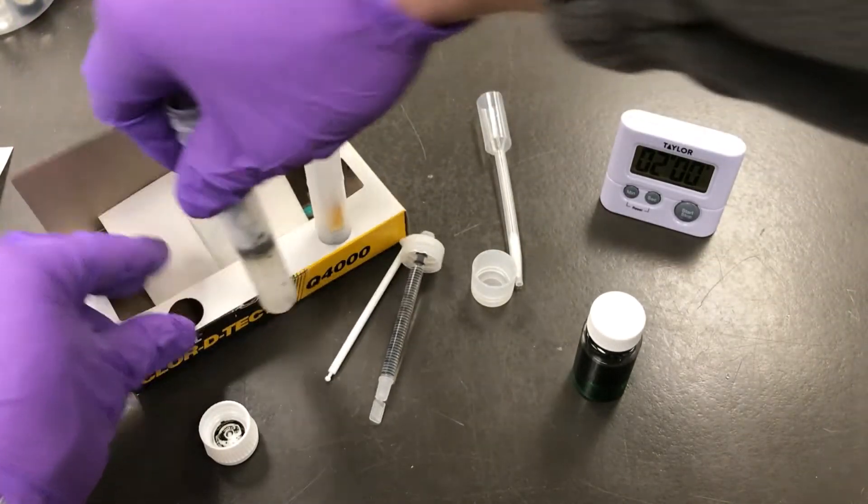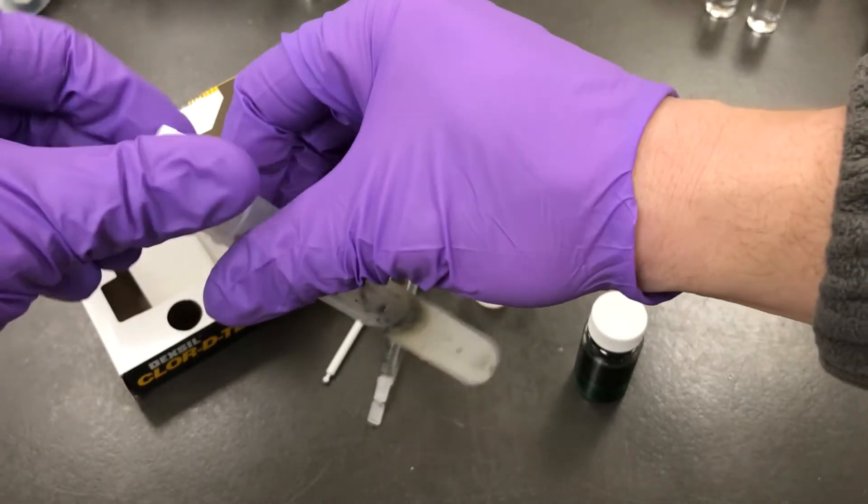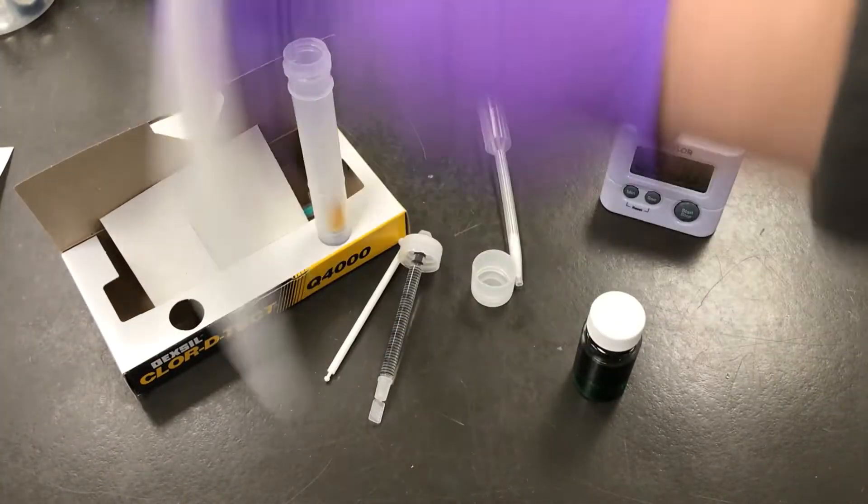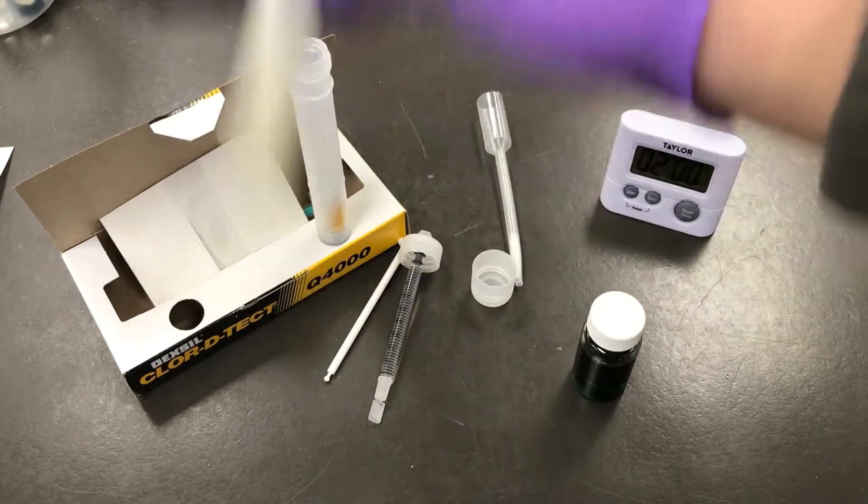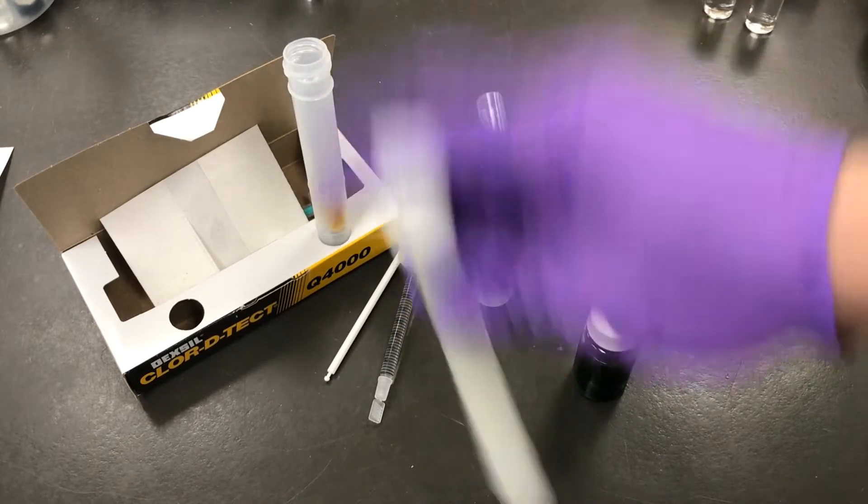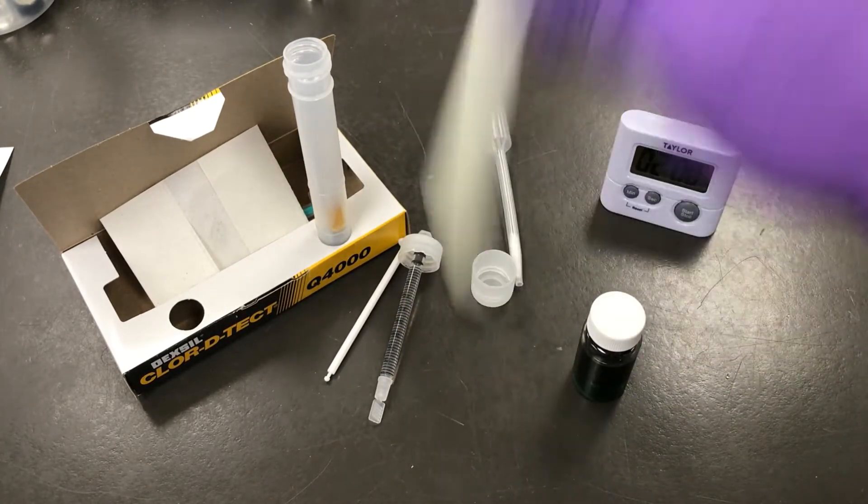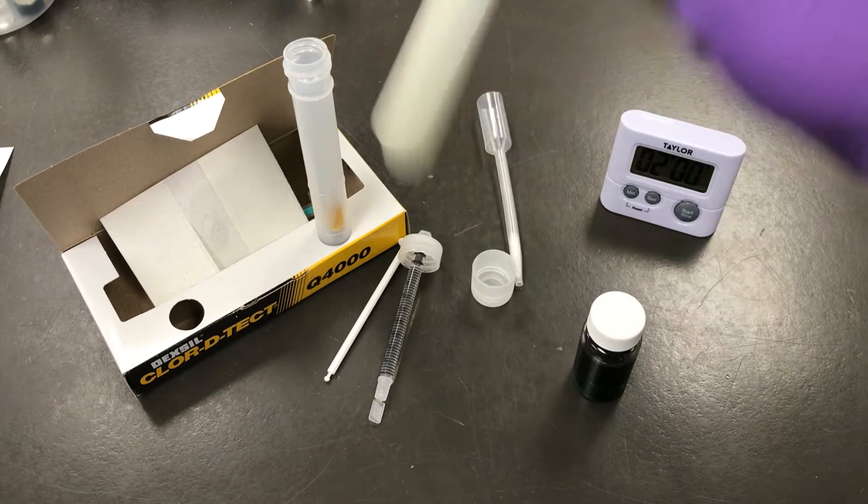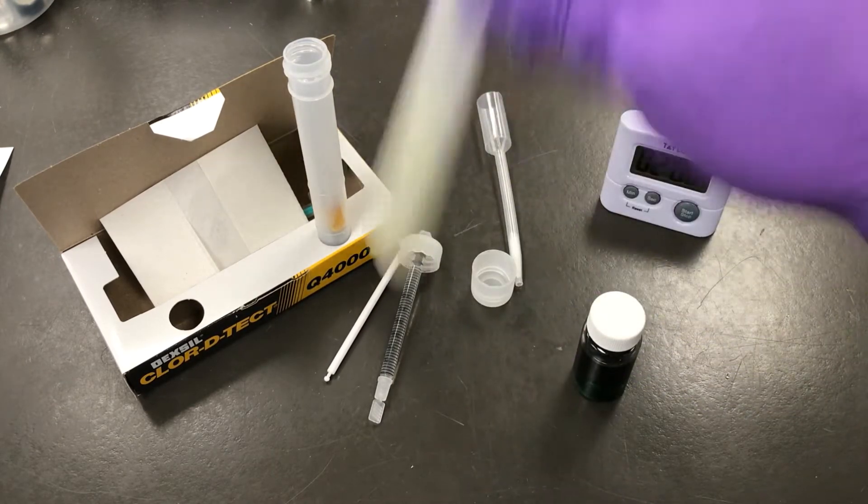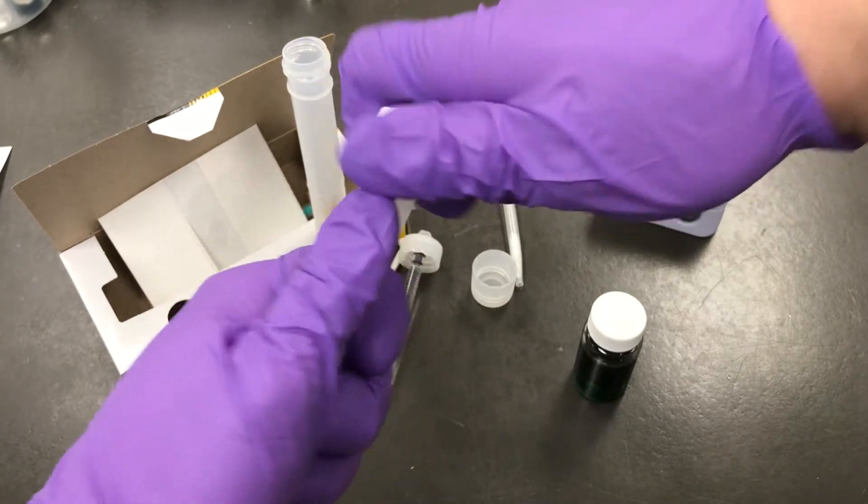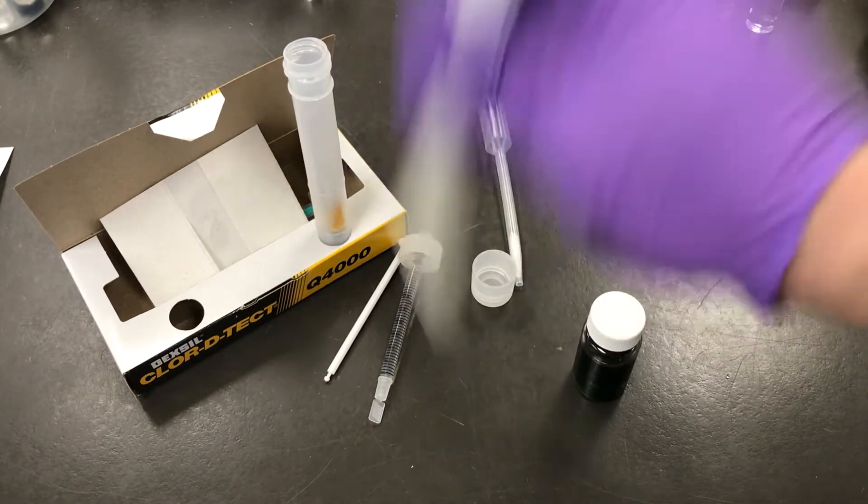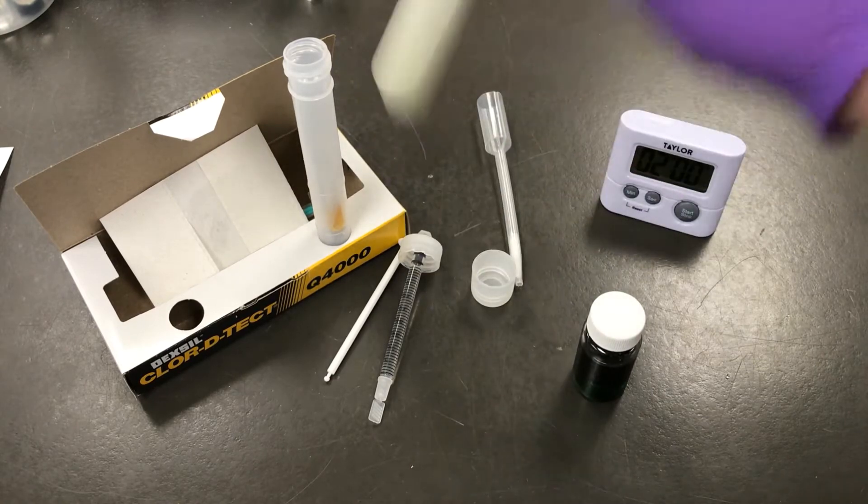Now replace the cap on test tube 1 and shake it for 10 seconds. Vent the pressure in the test tube by cracking the top, retighten, and shake it for another 10 seconds.